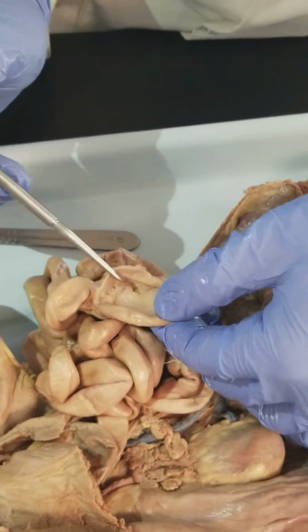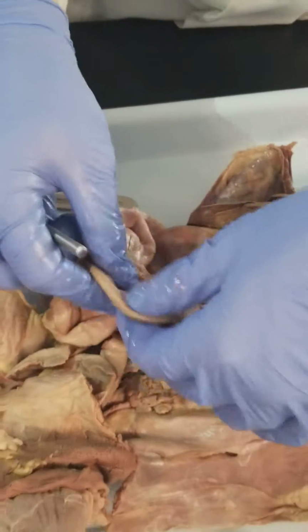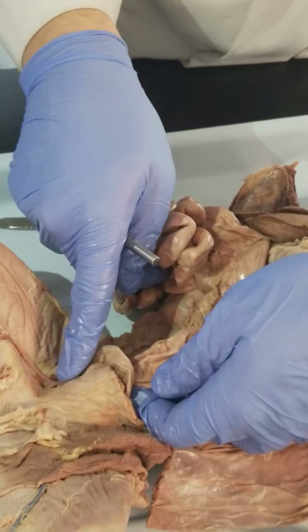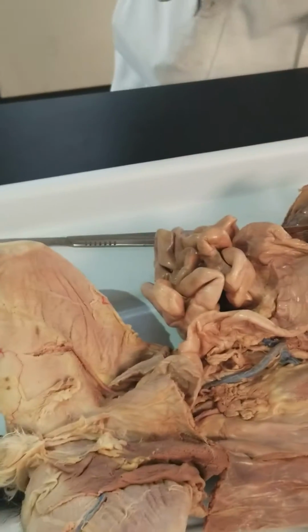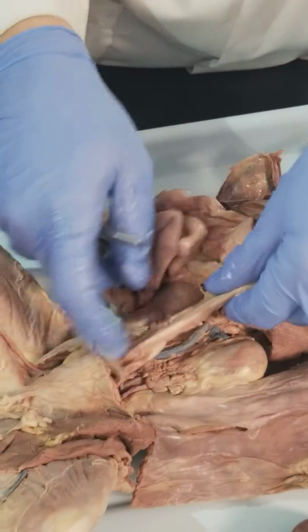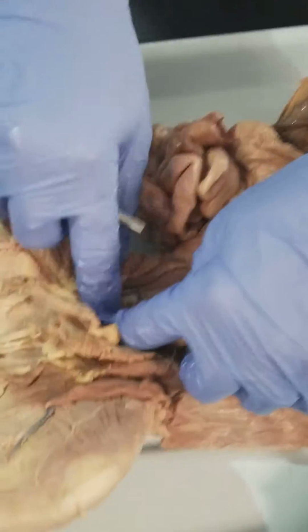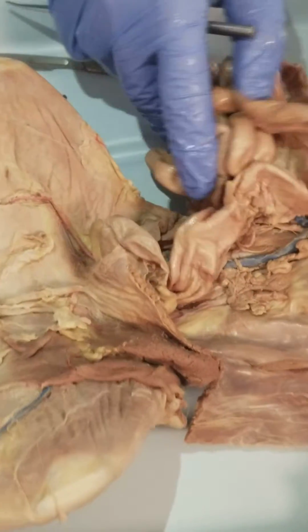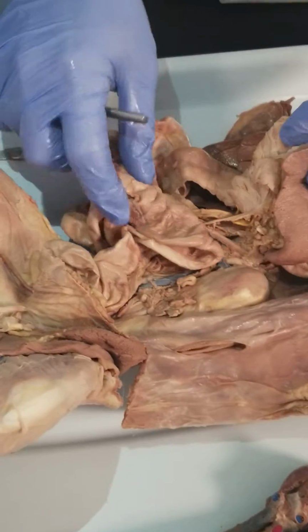So you go from the ileum into the cecum, and then you start to move through the large intestines. In the cat, it just basically goes straight through. In us, it starts to move from the cecum to the ascending, the transverse, descending, sigmoid, and into the rectum. And then the rectum is going to be right down in here in the actual cat itself. So that's the digestive system.